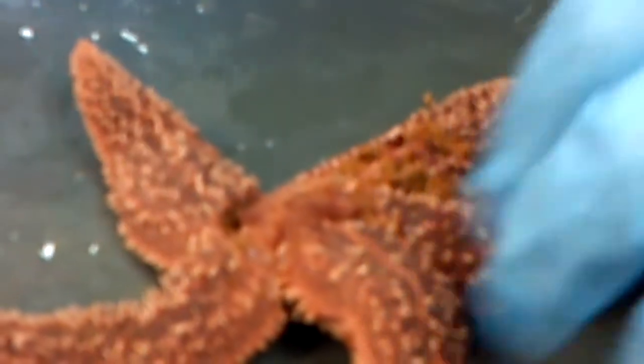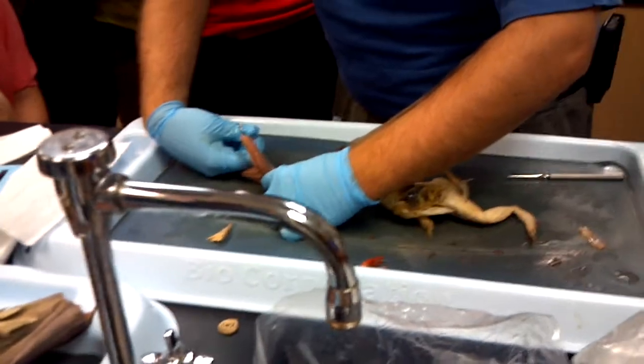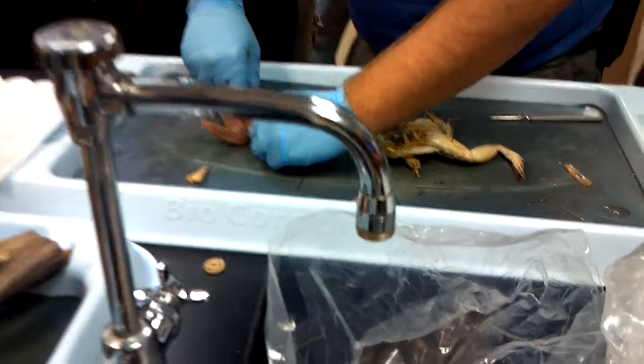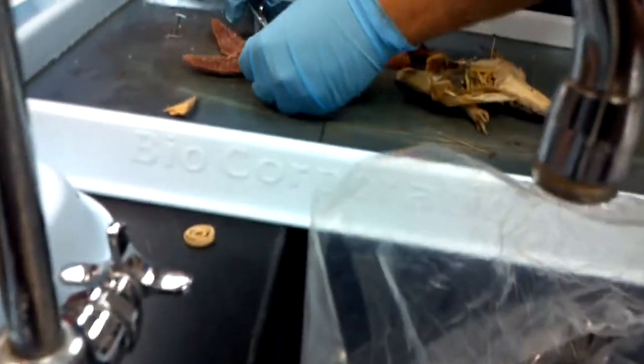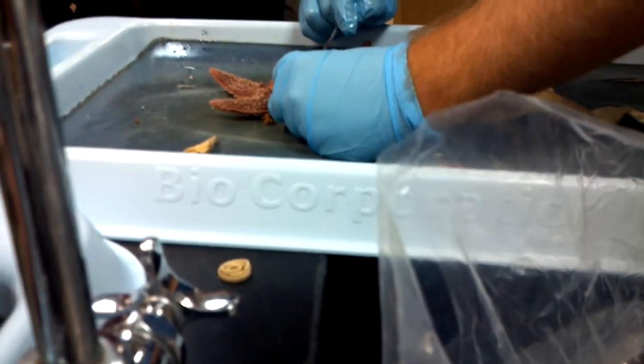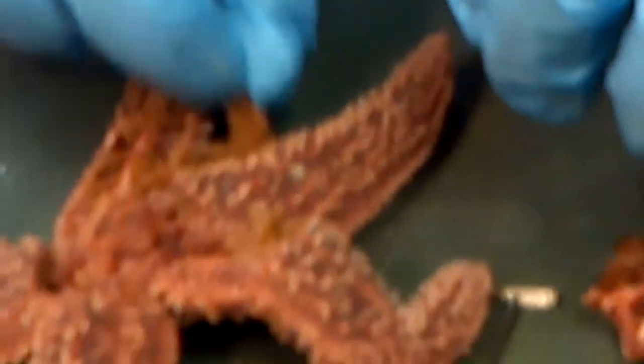I might actually cut into this guy on another arm to see if we can get some better gonads. There we go — here are the gonads. That one worked out perfectly. Hopefully the starfish I dissect later today will look this pretty, because that's what's going to get used on the practical. I'm tempted to use this guy — he's in such good shape, except for the glands I just tore out.